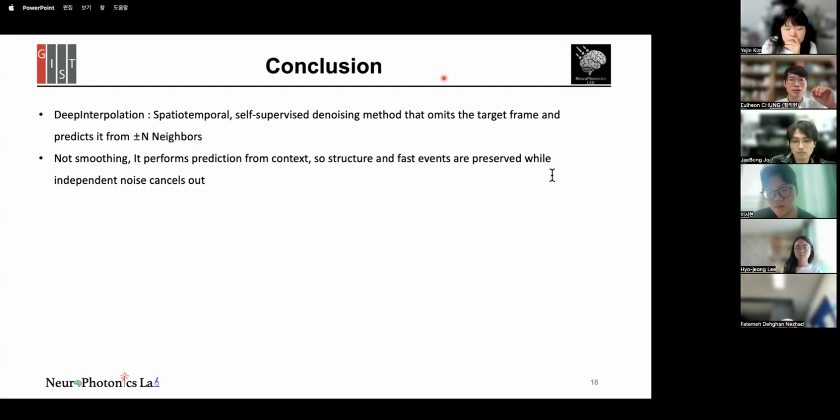So the number 30 is not the most important. In that paper, they did try various durations, but the important part is the actual biological signal, the decay kinetics of GCaMP6 fluorescence. They have done training and validation using their computation. So I think this is an important, key parameter when you use this.